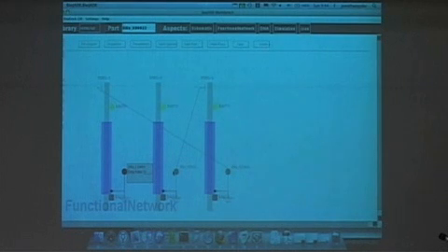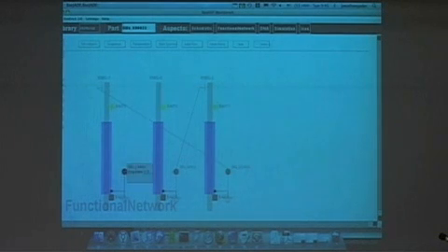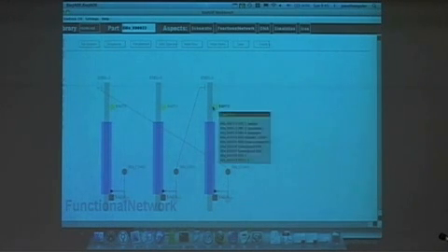And while this information should be pulled from the database, you can set the degradation rate of various species in the reaction network. So you can also change the ribosome binding site and tweak it that way.